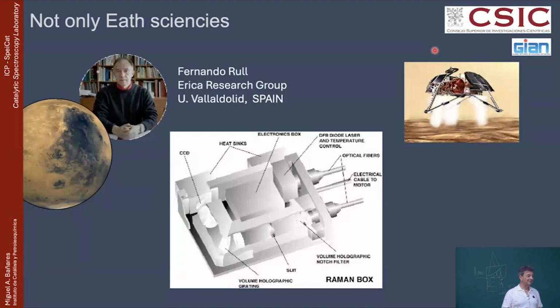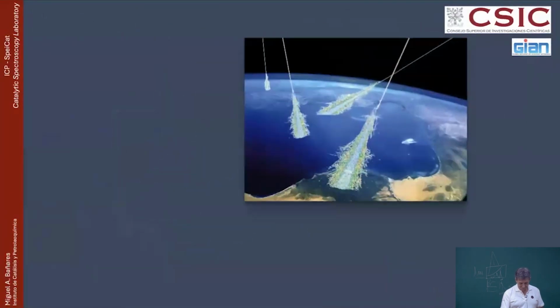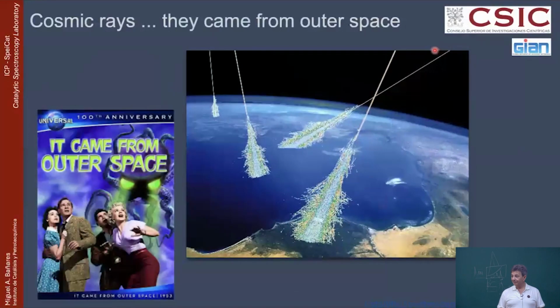Questions, comments, suggestions? Okay. So you mentioned the cosmic rays. The spikes are coming due to the cosmic rays. Yeah, they came from space. But you are doing it in a confined environment by using the laser. So how do the cosmic rays enter into this spectrum?